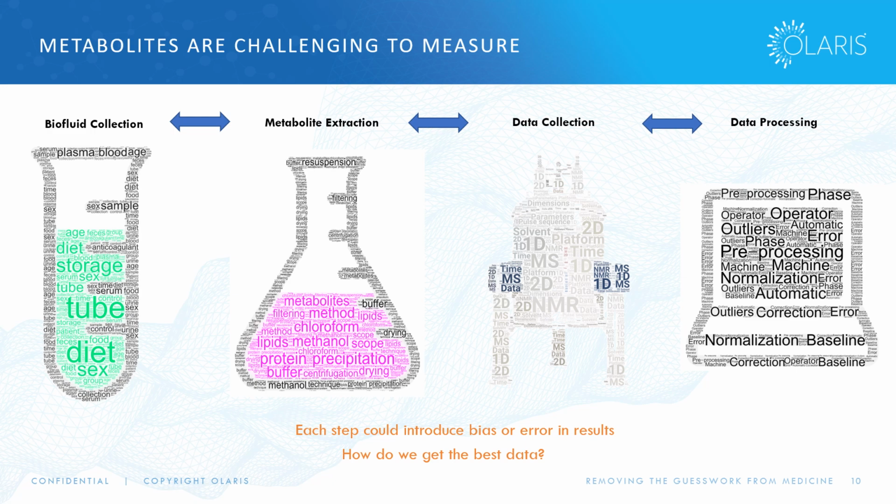What is the best platform for your project? Do you need MS? Do you need NMR? If you do NMR, is 1D enough, or do you need 2D? What are the best pulse sequences? And then we get to data processing.